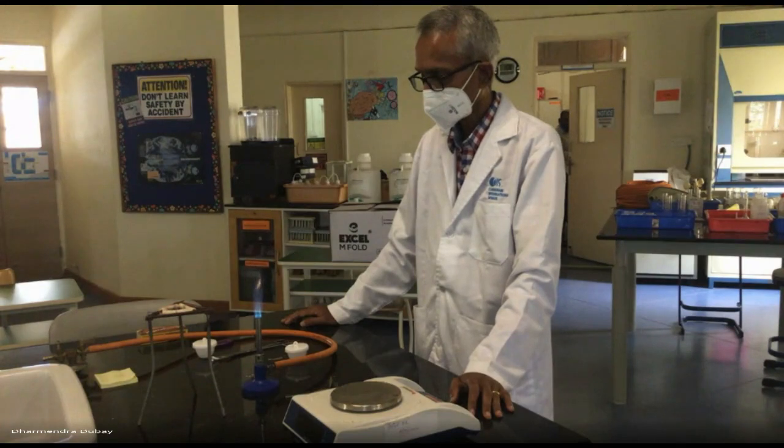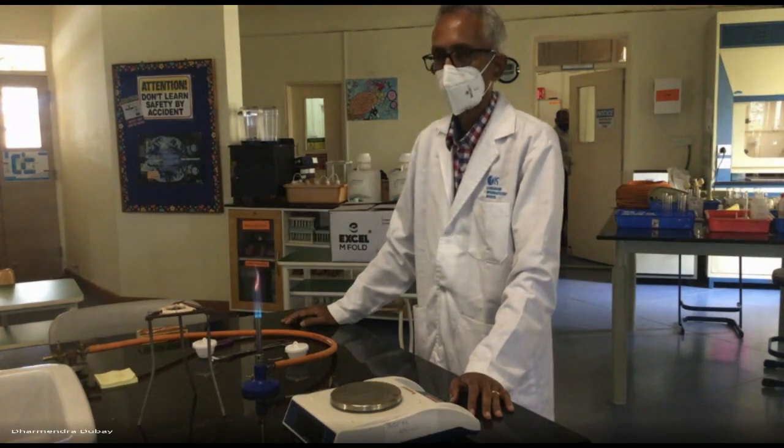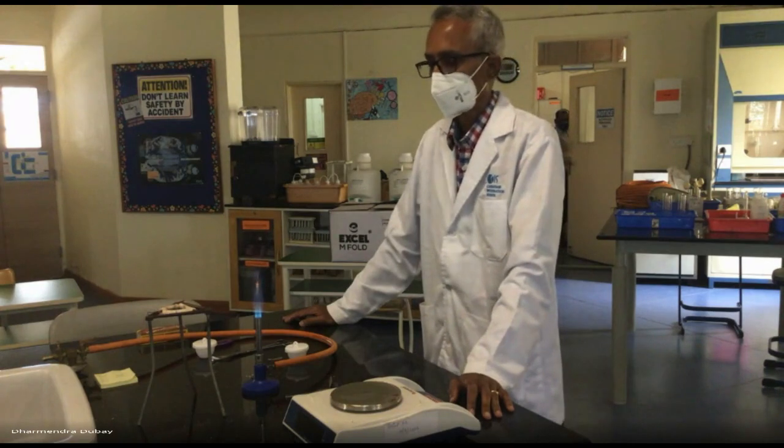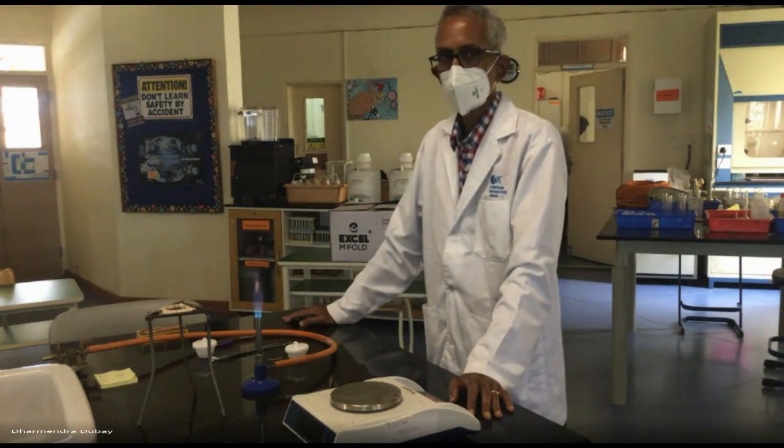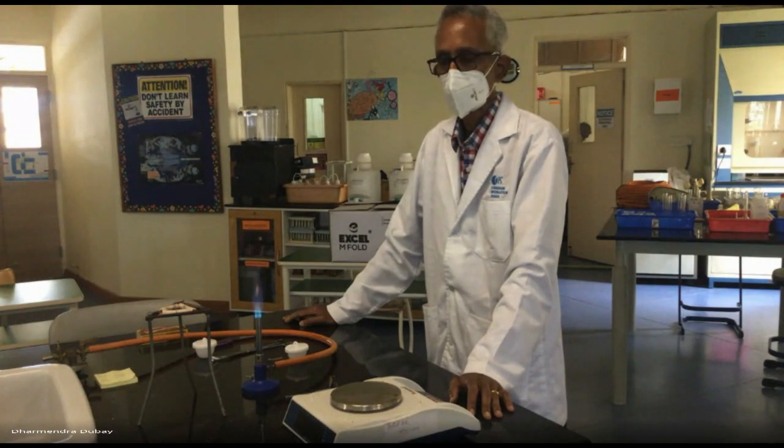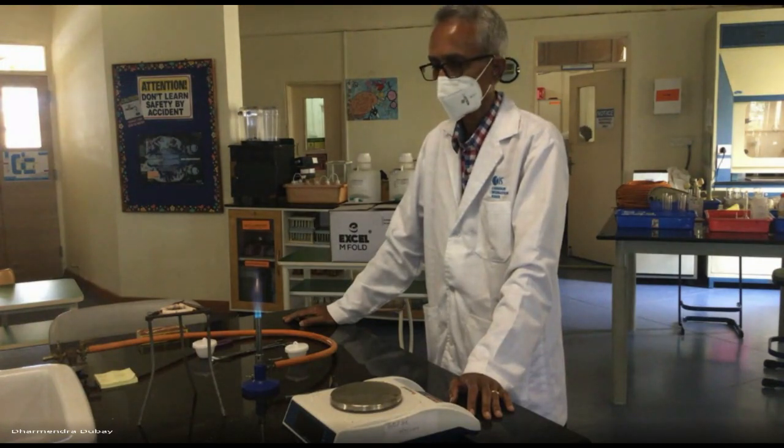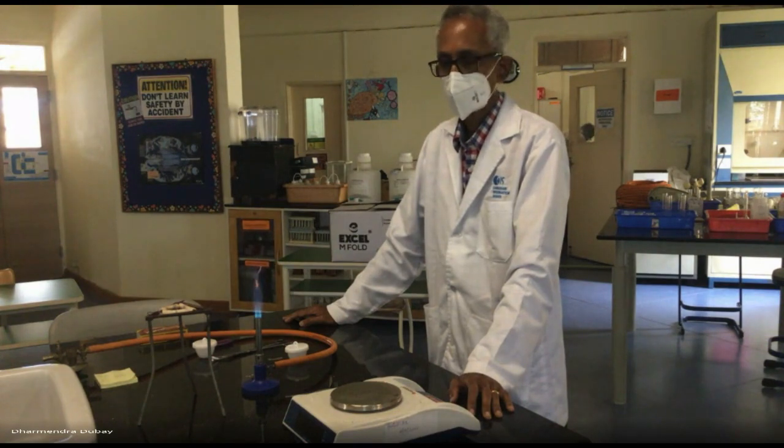But something happened when Mr. Ranjan was burning that strip that you don't want to happen if you are doing a proper experiment. What is it? When he just set it on fire, I don't think that would be a good way to go about doing our experiment. Before we actually do it the other way, I want someone to say what was the big concern about some place where a lot of mass would be lost.